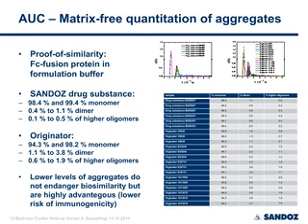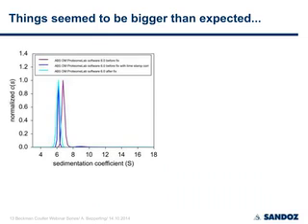Okay. What also came up during last month, but it's now fixed, is that when we did cross or multi-site calibration studies, or if you have more than one instrument in your lab, that the S values you got from different machines were quite different, and this led to a series of experiments designed and also published by the group of Peter Schuck to improve the radial and thermal precision of the temperature control of the machine by correcting it and calibrating it using external standards.